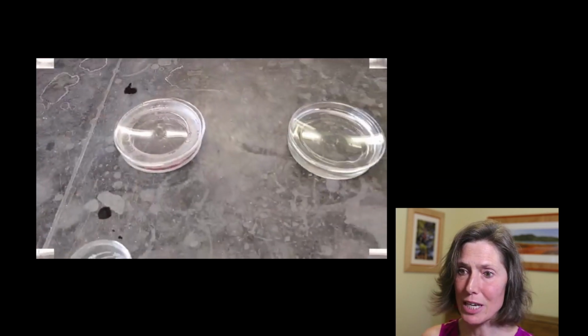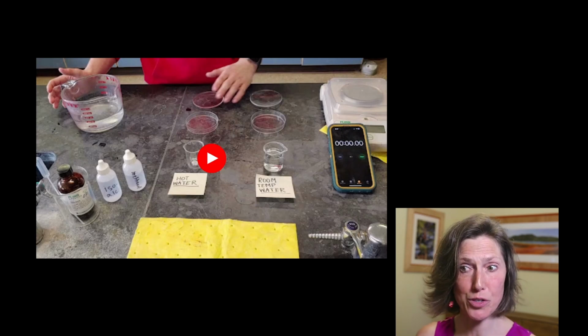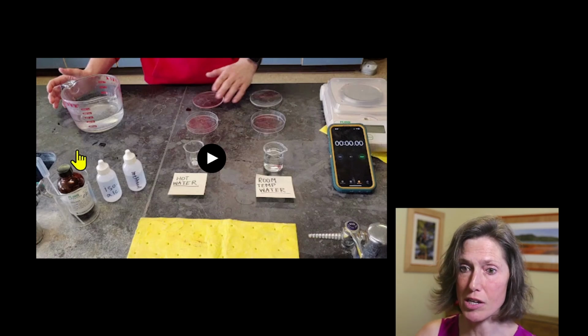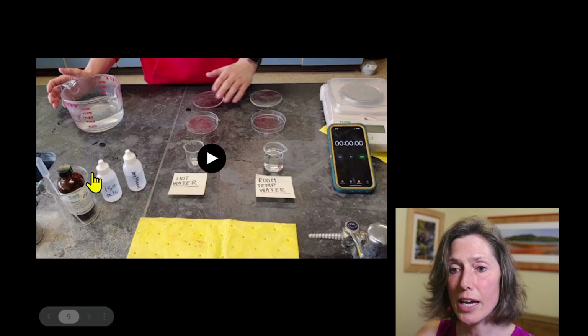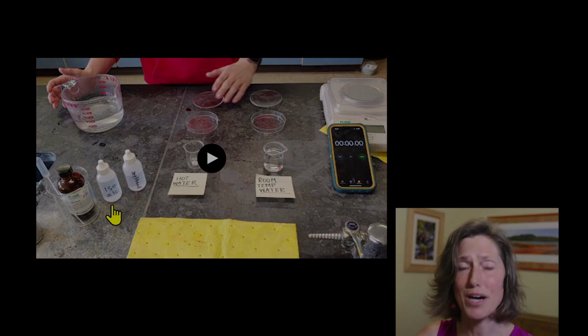And then it's literally waiting for that drop to vanish. My other student is hitting the lap button to stop when that first warm watch glass caused the 1 drop of methanol to evaporate. It took a little bit longer for the one that was colder. You would do the exact same thing with the other 2 substances, namely the pentane. This one is very volatile and a little bit difficult to get just 1 drop on the watch glass. And they will also do it with isopropyl alcohol, which might seem to take an excruciatingly long time, possibly 100 to 200 seconds.